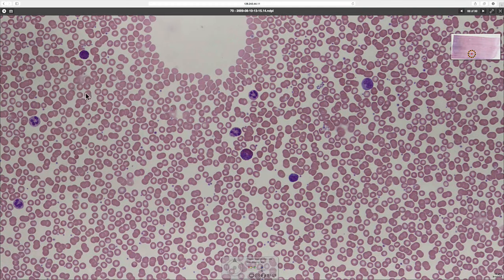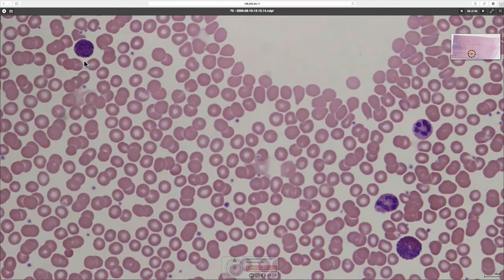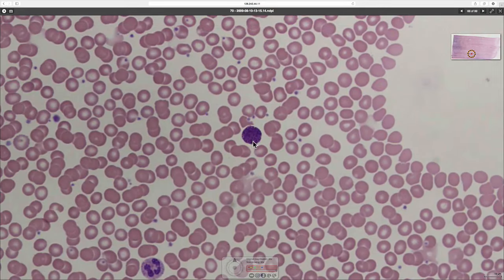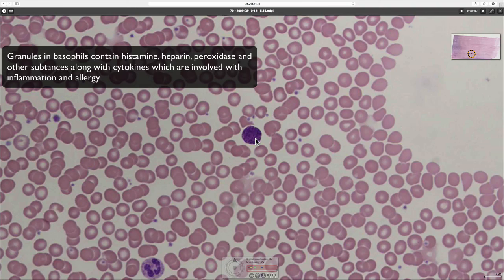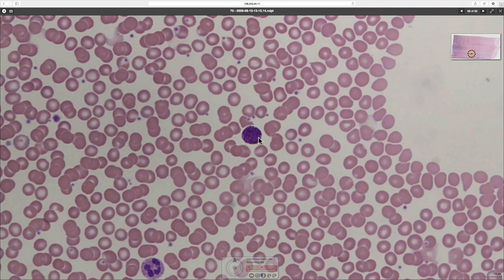The final granulocyte is a basophil, and there are very few of these in the blood — only about one percent of white blood cells are basophils. This one is identifiable as a basophil because it has so many granules that the nucleus is completely obscured. The nucleus would be lobed, but it has large purple granules that are the same colour as the nucleus. Basophils are called basophils because their granules attract haematoxylin, which is a basic dye.